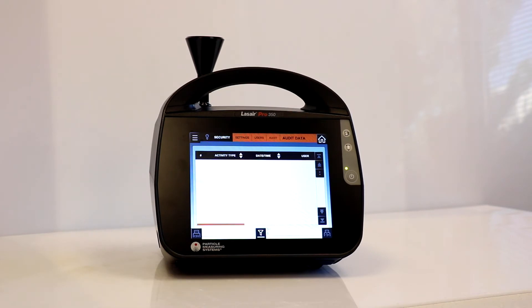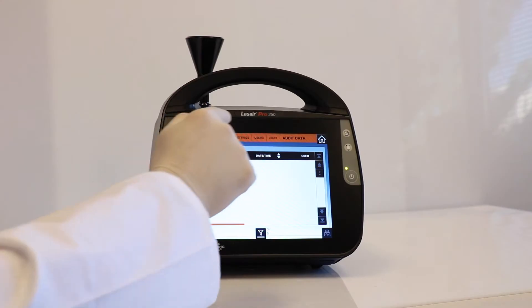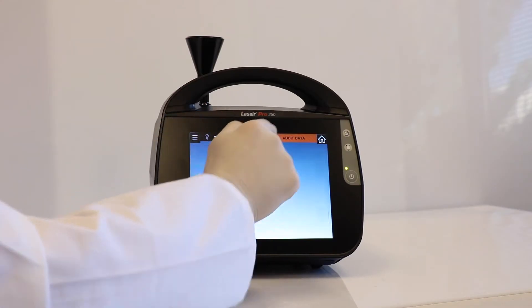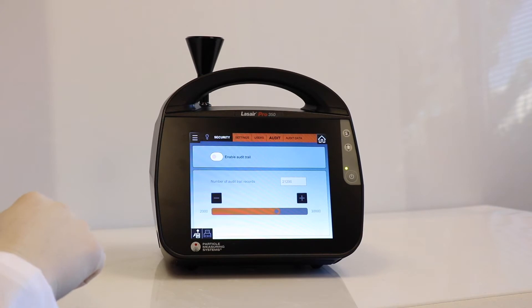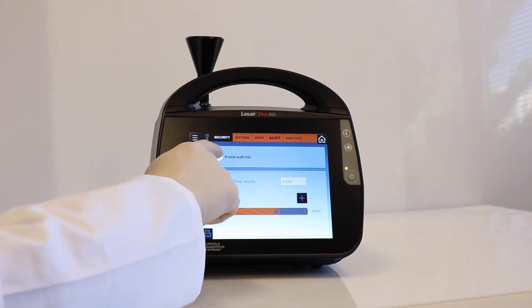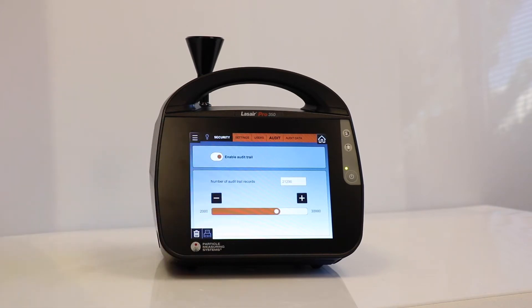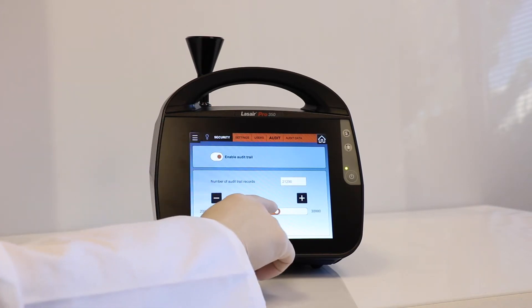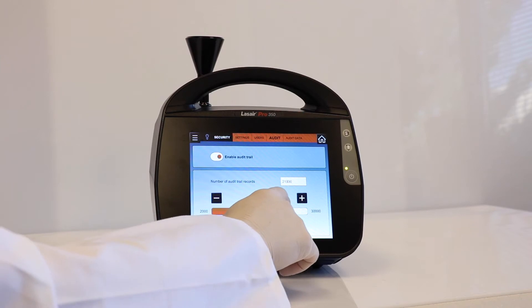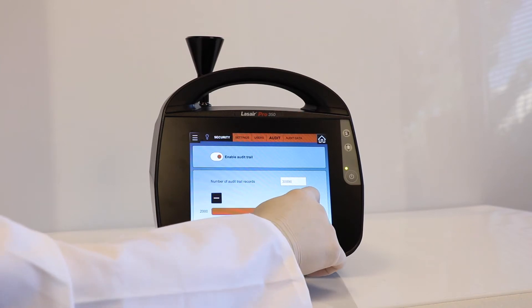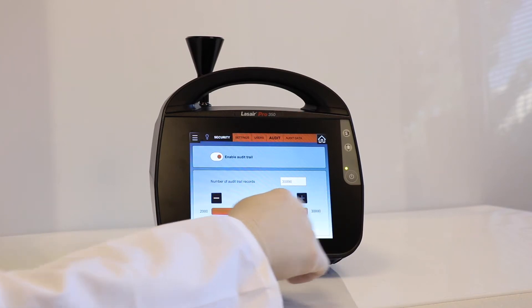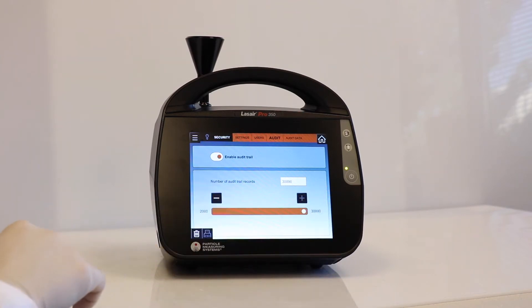We select the audit tab to enable the audit trail. Below, you can adjust the settings for how many records to store in the audit table. 2,000 to 30,000 records can be stored on a first-in, first-out basis.